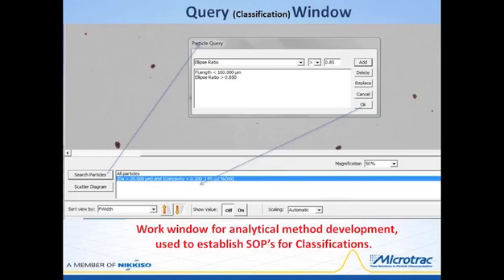Here we've entered a group or classification of particles from this sample that are less than 100 microns in length and have an ellipse ratio greater than 0.85, which eliminates particles considered oversized and not very circular in shape. By clicking OK, that query will be added to the list of queries as indicated by the arrow. Any number of queries or classifications can be created this way and selected as desired. The image file and the scatter diagram will then display and report data for only the classification selected.